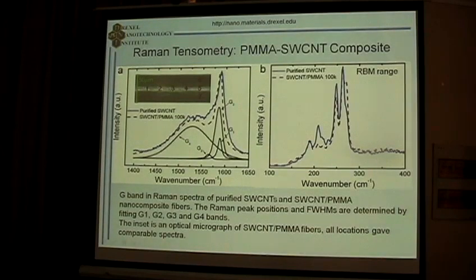And of course, a more accurate way is to compare with anti-Stokes, but in many spectrometers you cannot record anti-Stokes spectra with the same intensity. So it's often convenient to monitor change in temperature just purely from the Stokes band shift. So in case of nanotubes, it will be mainly because of the strain? No, it is basically because of expansion, purely expansion. So basically elongation of the bond of the material.